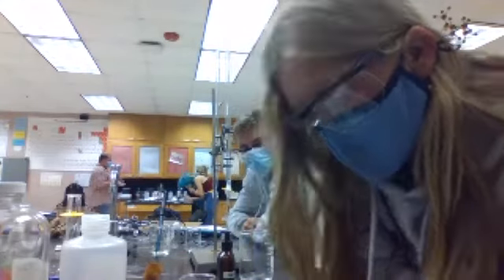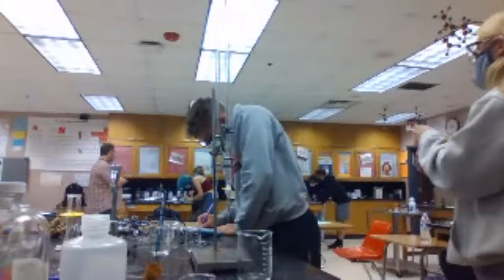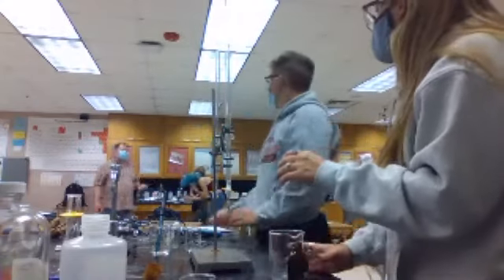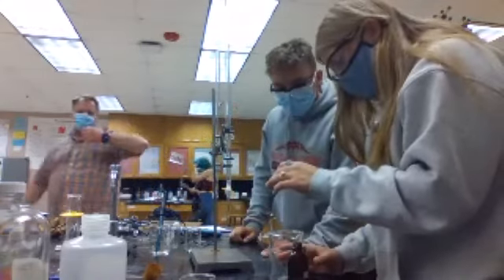No, you're gonna use the same one because we do the law of averages. Now we do 4 drops. Do we do 4 drops again of phenolphthalein? Yeah, it's the same. 4 drops. And you have to get the pH curve of that one too. You guys are gonna get called out though. You're not gonna finish.